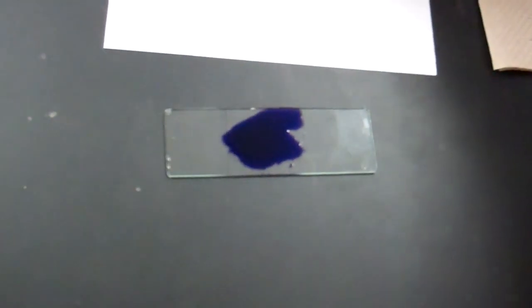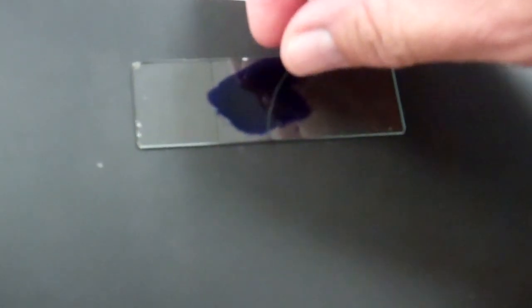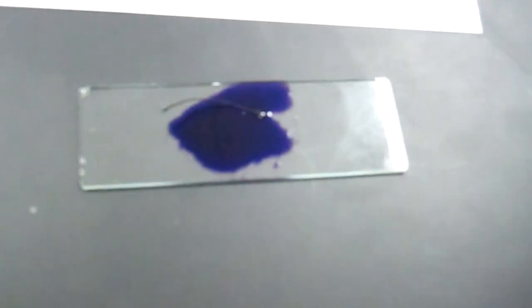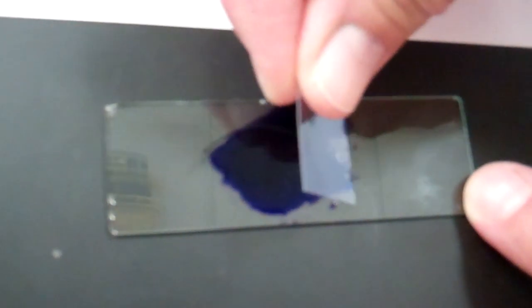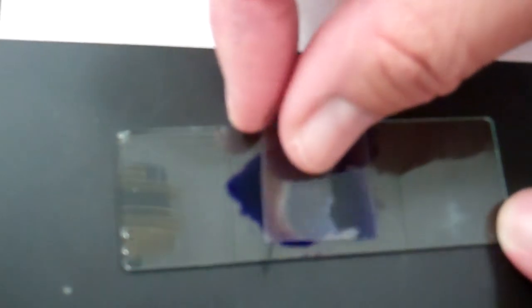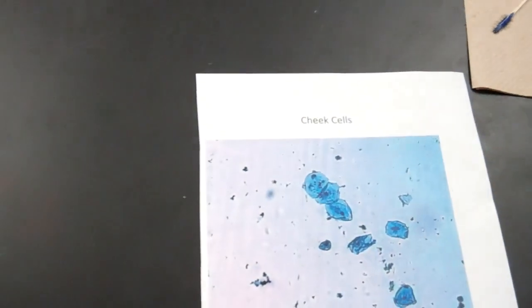Take your thread or your hair and lay it into your drop and then add your cover slip. Again, using the angle, slowly lower it down so you don't get too many air bubbles. And then you're going to look at it and draw your cheek cells on high power.